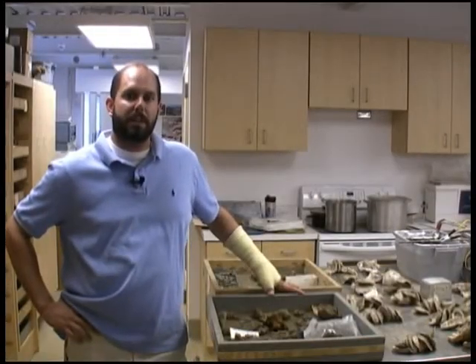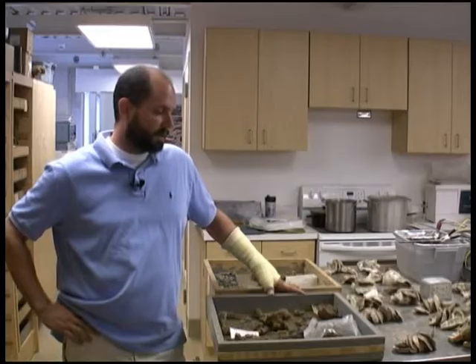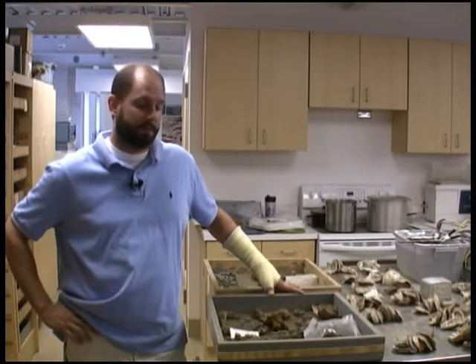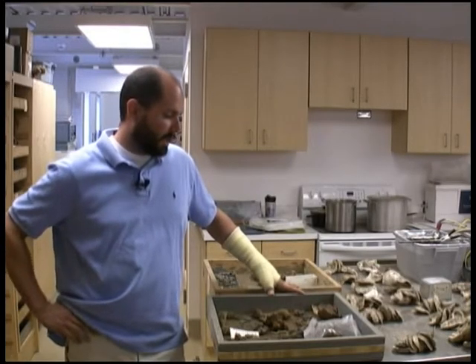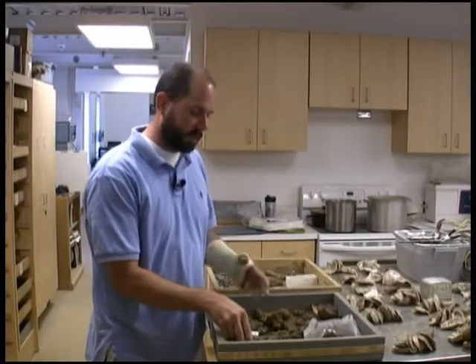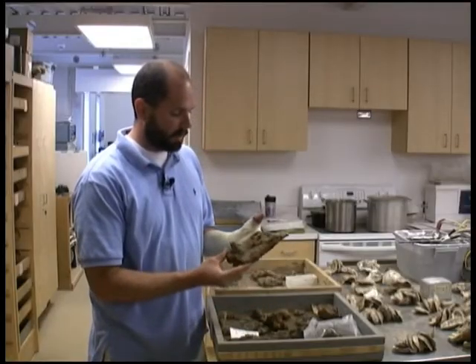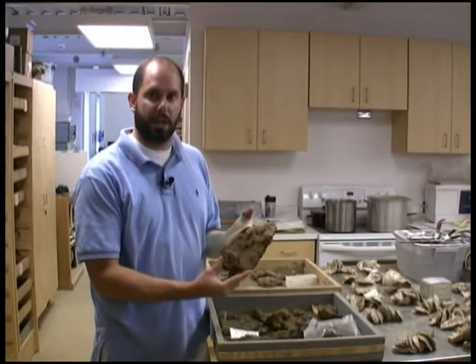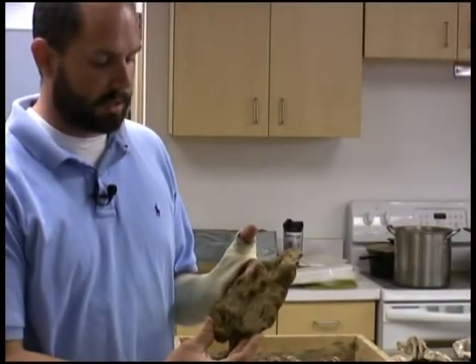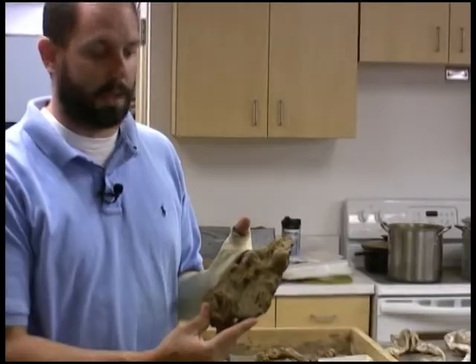My name is Michael Lavin. I am Senior Conservator for the Jamestown Rediscovery Project and we are here in the lab on the premises of Jamestown Island. In front of me I have a tray of artifacts that have come in from the field. If you look closely you can see that these haven't been washed yet, and the reason for that is we are on city water, which has chlorides in it.